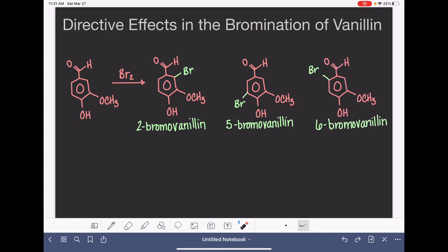These three molecules would be very difficult to distinguish in IR because they have the exact same functional groups present, and that's really what IR tests for. So we're going to be identifying them based on their melting points because they have significantly different melting points. Once we synthesize the product of this reaction, and we're initially not going to know which one it is, we'll measure the melting point of the product and we'll see which it matches up with the most.